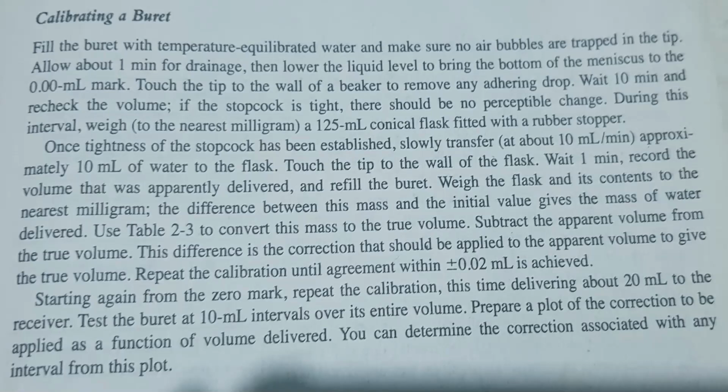And then touch the tip of the burette to the wall also of the flask, so that the last drops will go to the flask. So wait 1 minute and then record the volume that was apparently delivered. So record that, right? What we delivered should be 10 ml.